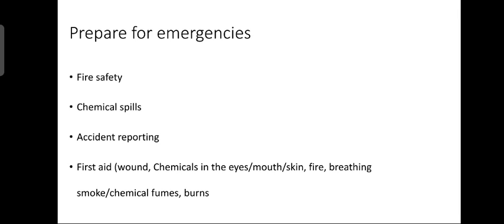First let us see fire safety. Fire is the most common safety hazard in any organization. Therefore, it is very essential for everyone to know how to survive a building fire and what to do in case of a fire. Let us see some common protocols and procedures that may be followed during a fire emergency. Now, action to be taken in the case of building fire.